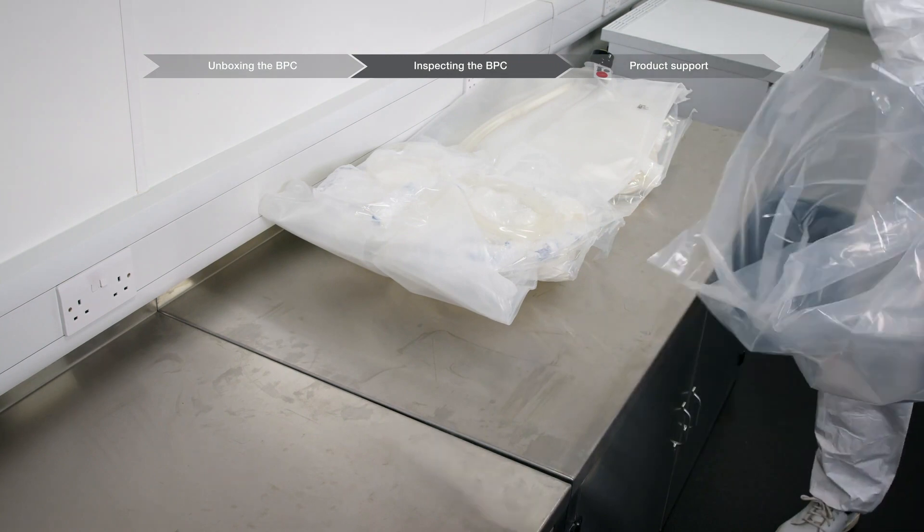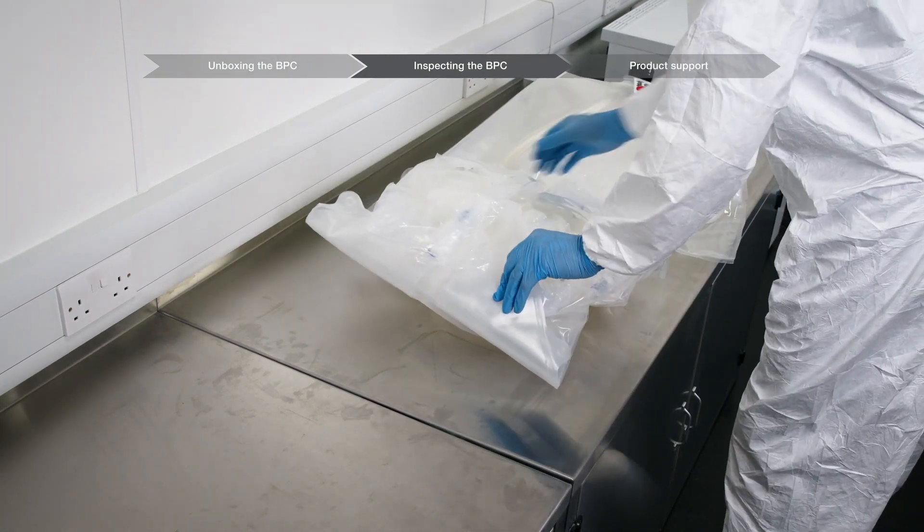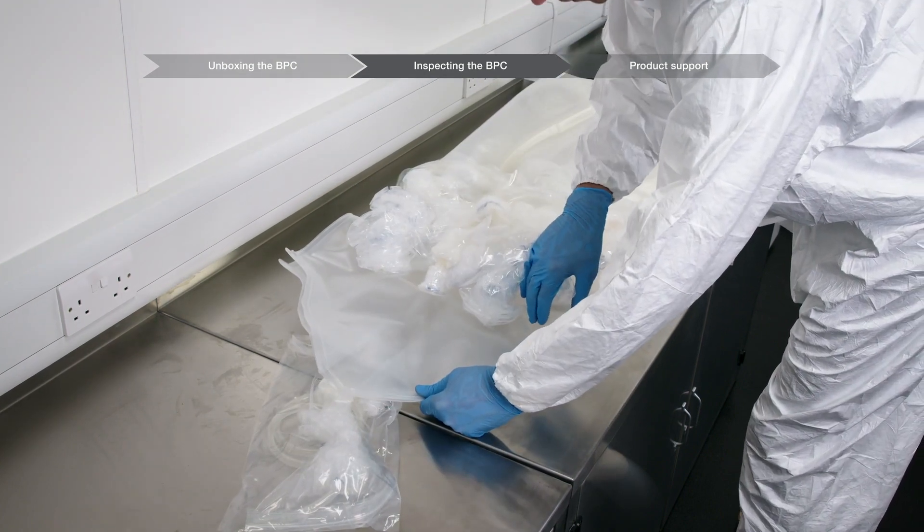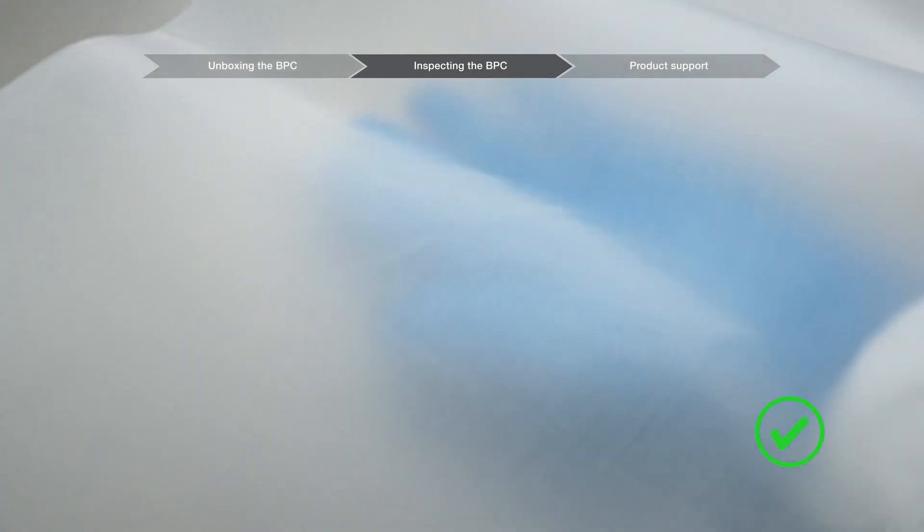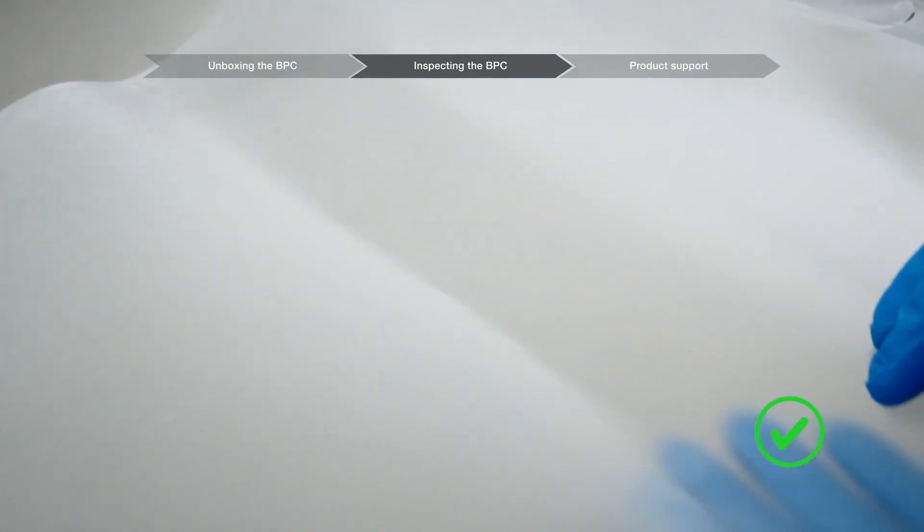Place the BPC on a proper workspace surface. If using a larger BPC, unfold the chamber either all the way open or in segments to inspect for damage or abnormalities. Normal folding marks, light surface wrinkles, and light stress marks are acceptable.